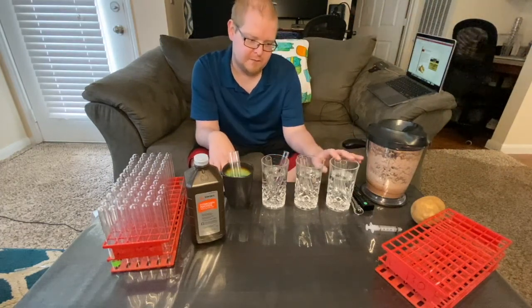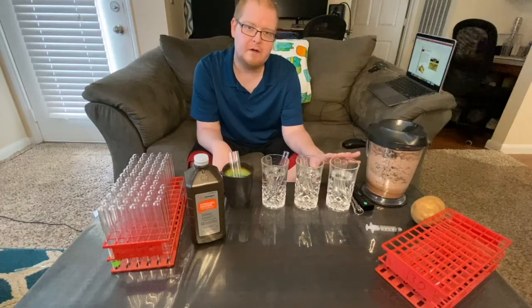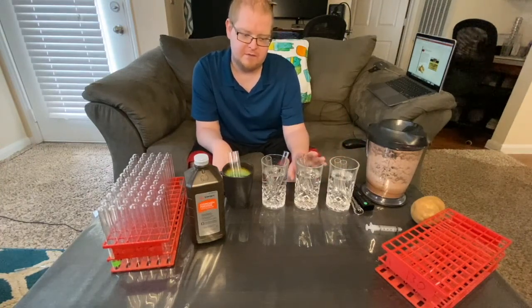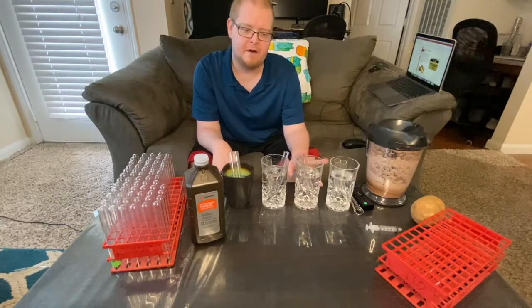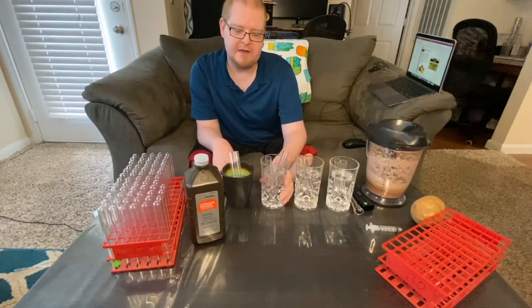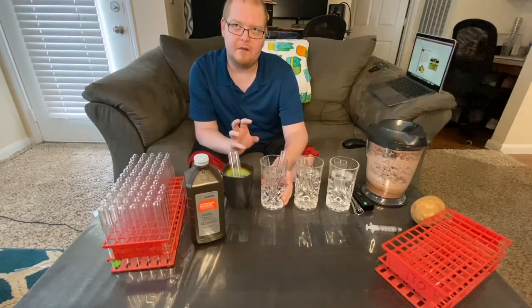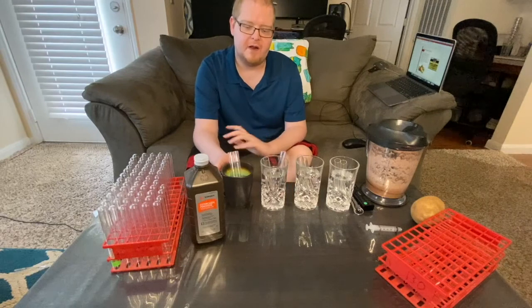This one I have cold water, basically water and a little bit of ice. This one I have room temperature water. This one I have warm water, basically just run some hot water in the sink. And this one I have boiling water.